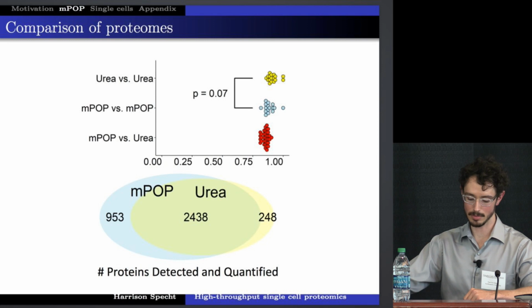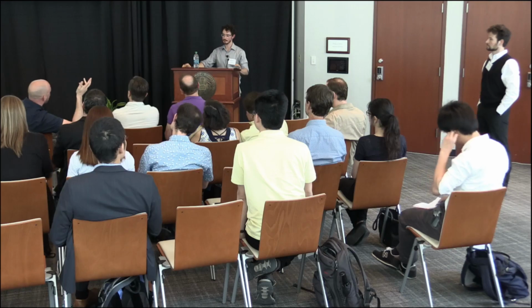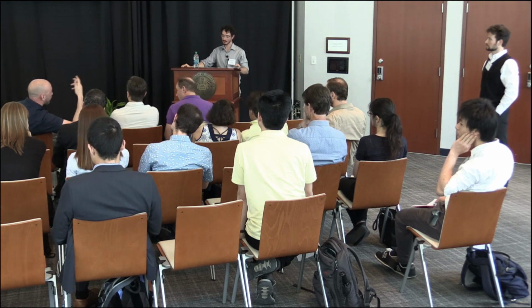But we included those samples with that in mind, with optimizing for the single cell protocol that we hope to do with it. I mean, trypsin is dead after about 3 hours anyway, so I guess that's what I'm wondering, is what's happening further down the road.